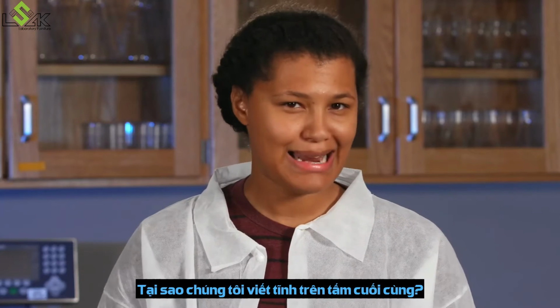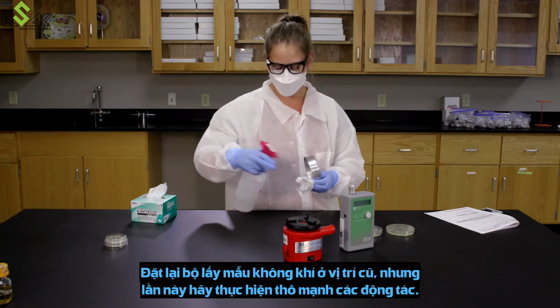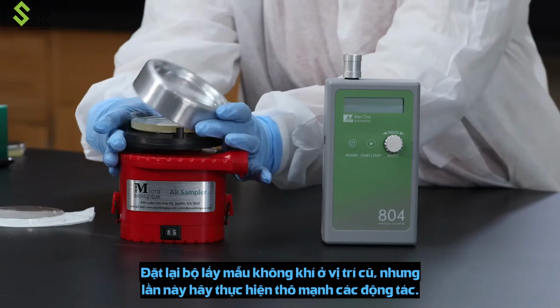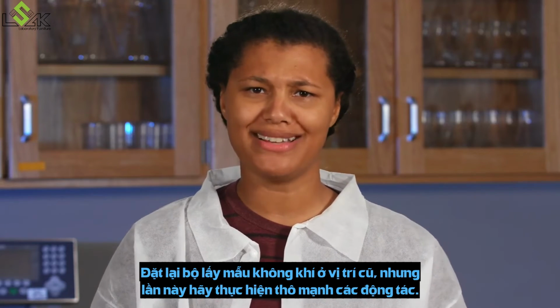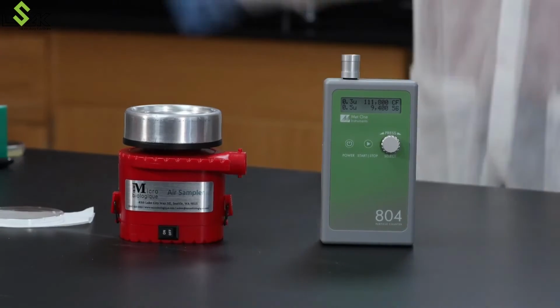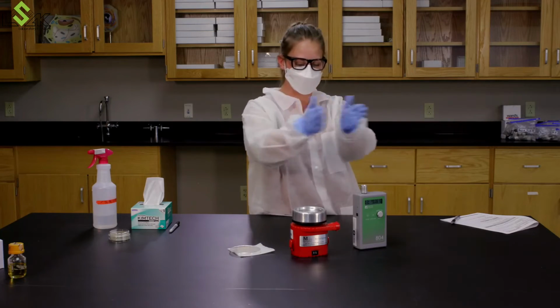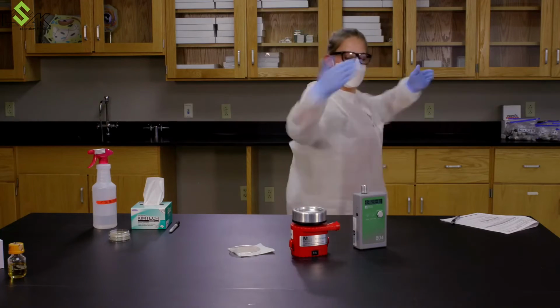Why did we write static on the last plate? It's because next we're going to have a little fun. Reset the air sampler in the same position, but this time let's really amp up the human shedding. Cassie here is going to do some jumping jacks, and hand clapping, and some whatever that is.